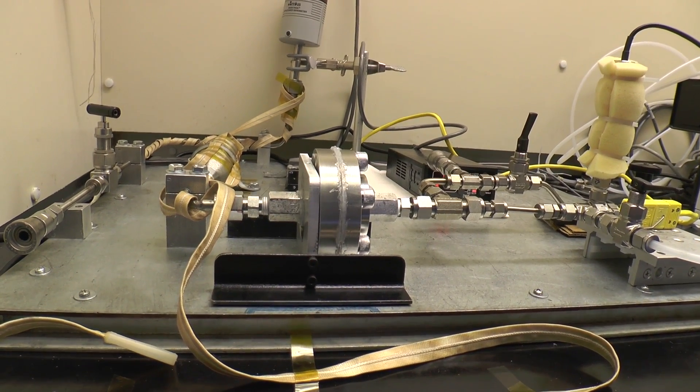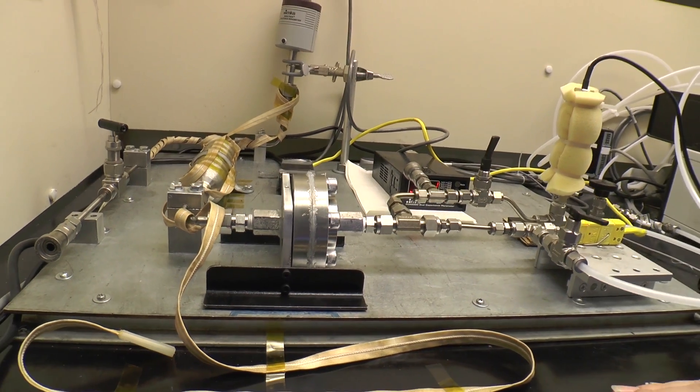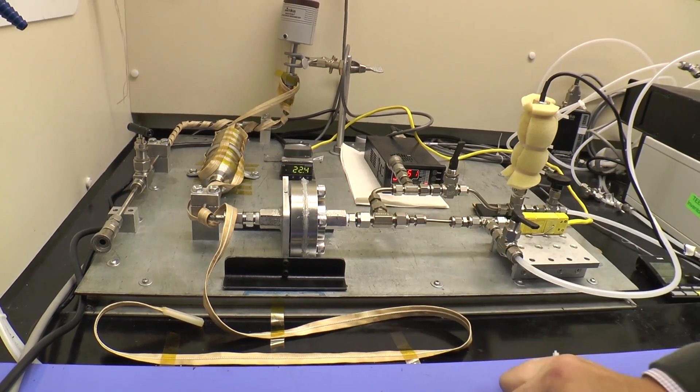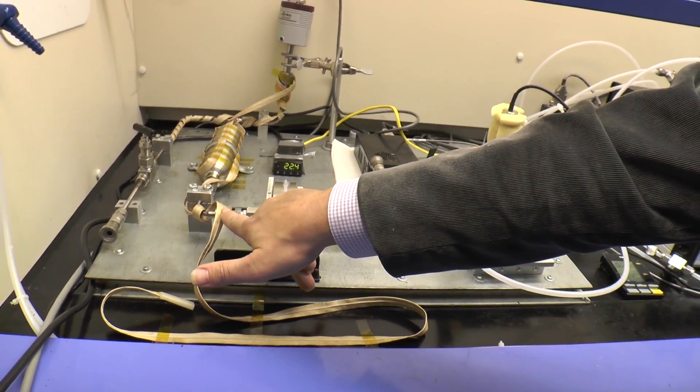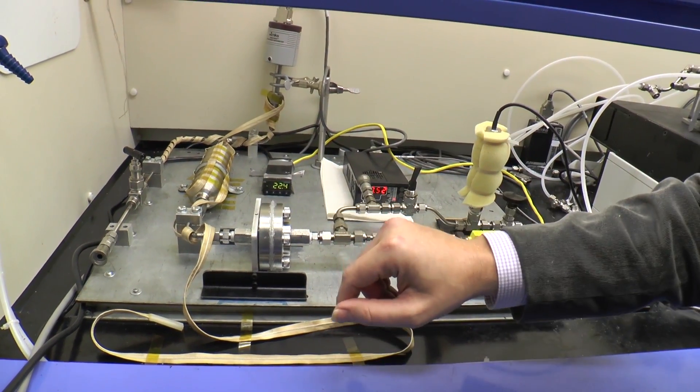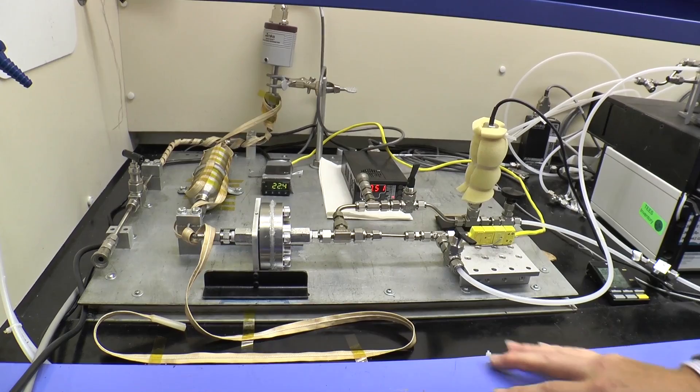That allows us to back out what the permeability of the membrane is given that we know the pressure on either side and the rate of pressure increase, which allows us to calculate how much gas is coming across the membrane.